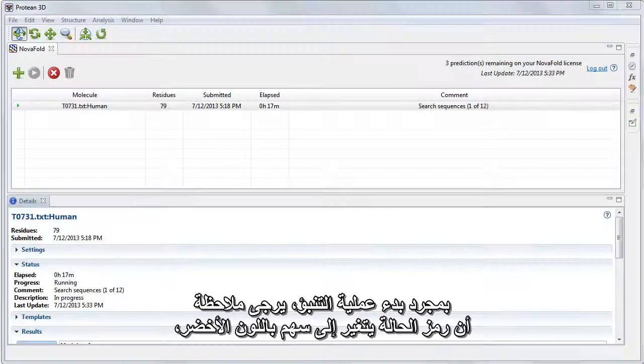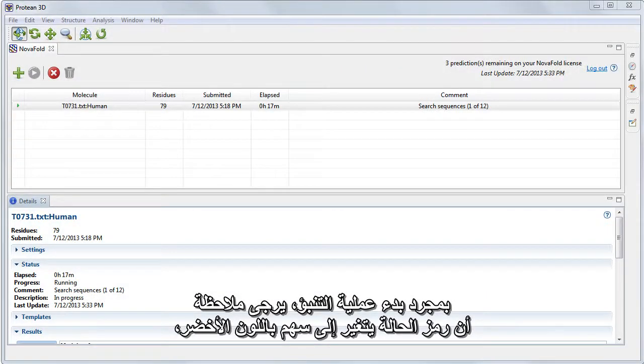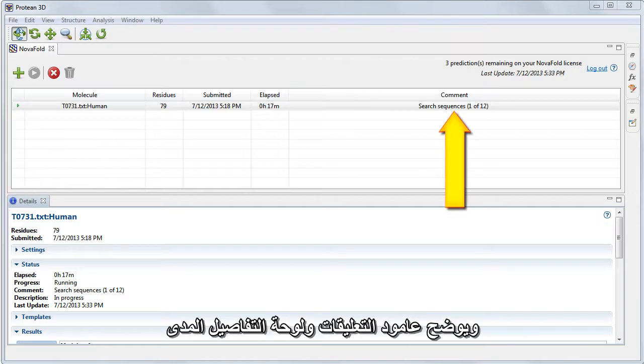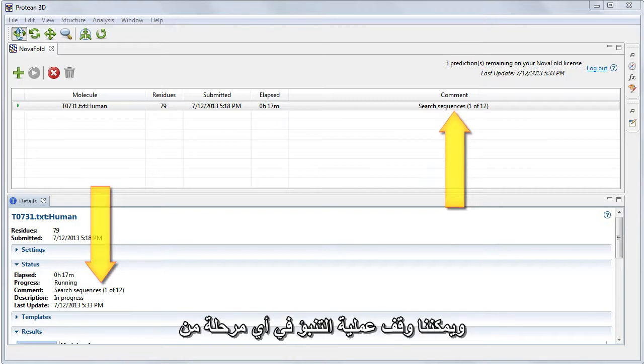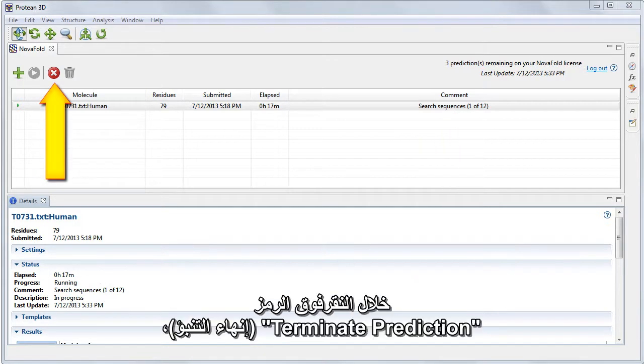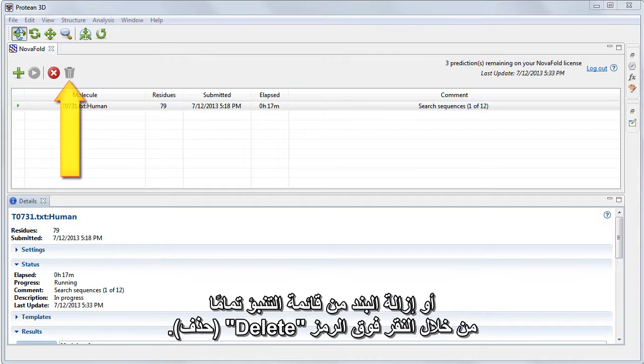Once the prediction begins, note that the Status icon changes to a green arrow, and the Comments column and Details panel show how far the prediction has progressed on a scale from 0 to 12. We can stop the prediction at any point by clicking the Terminate Prediction icon, or remove the item from the prediction list entirely by clicking the Delete icon.